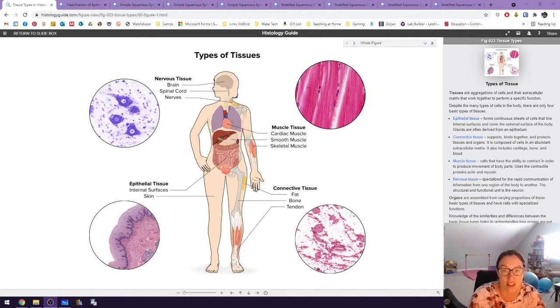All right, the next histology video, we're going to move on to epithelial tissues. So epithelial tissues are going to cover our body surfaces and line body cavities. So they're coverings and linings. Whenever you see, like in this slide, the tissue sort of ends and you see this white space, whatever is covering or lining that area on the very end, open to the external or internal environment, that is going to be your epithelium. So it's going to be on the edges.